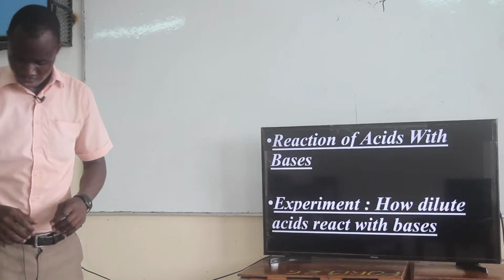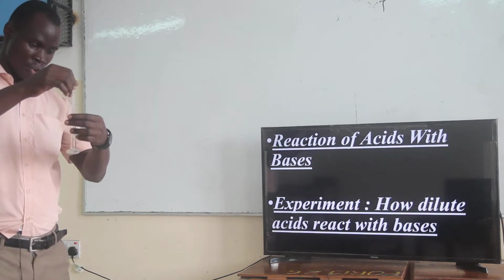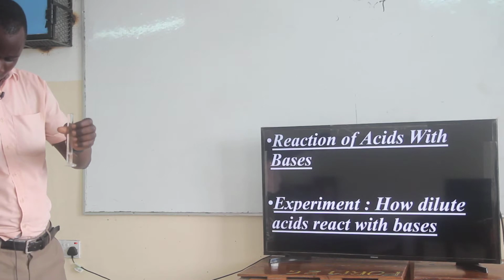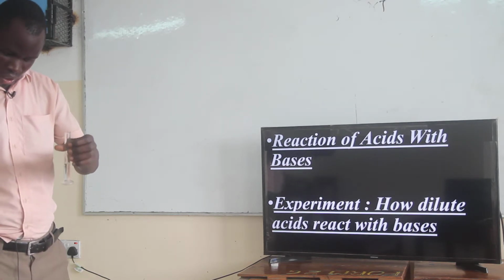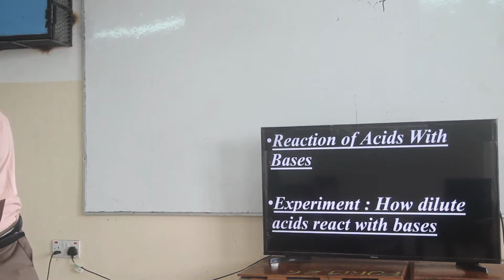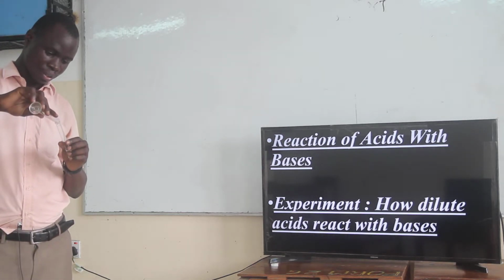Now what we are going to do here: I'm going to take the contents and pour them into a test tube. This is the base inside here. Our main objective here is to determine the endpoint.